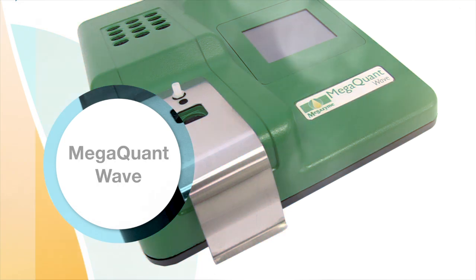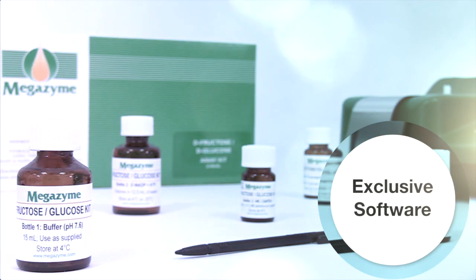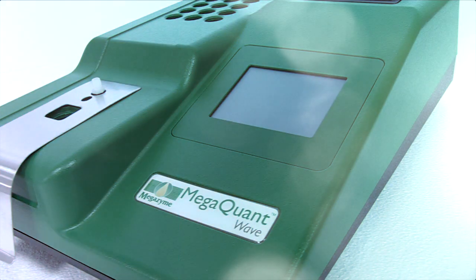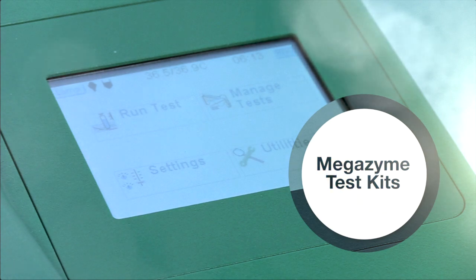The Megazyme MegaQuant Wave is a compact, economical, standalone visible spectrophotometer supplied with exclusive software that offers the capability of up to 4 absorbance readings per sample to accommodate sequential reactions. The MegaQuant Wave is supplied with exclusive pre-installed protocols for use with manual assay procedures of the Megazyme test kits.